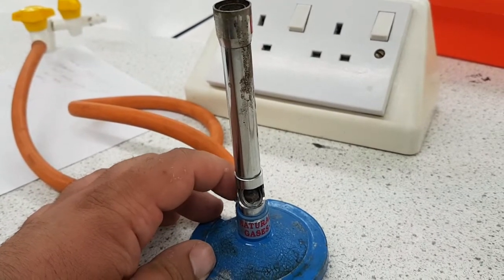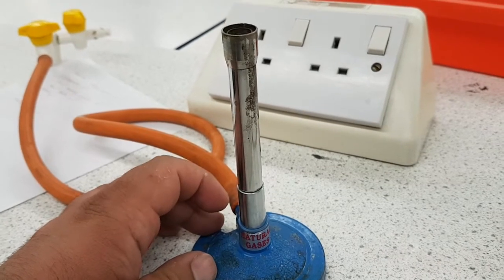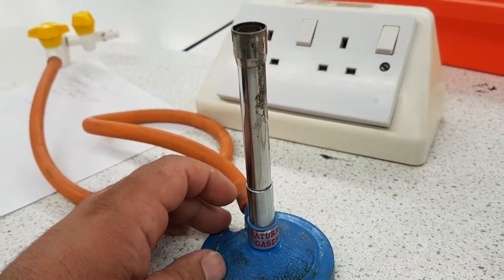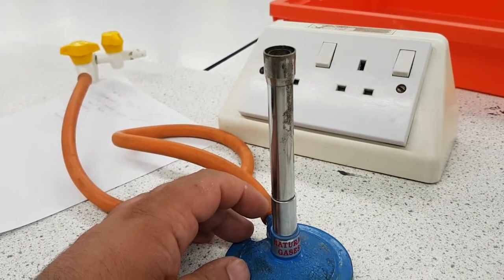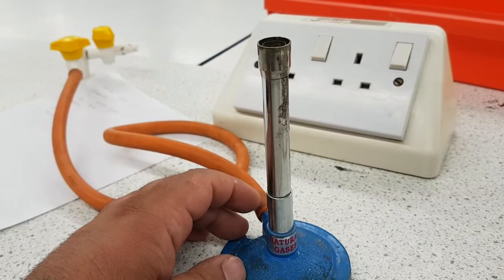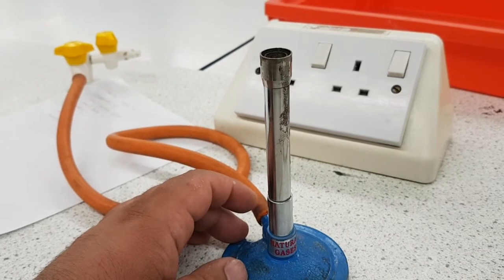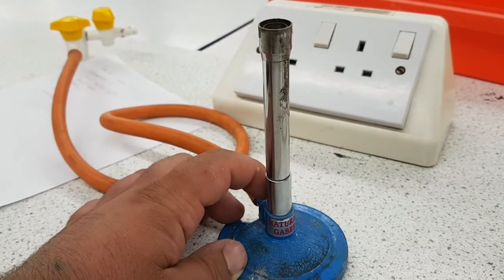When you want the flame to be visible, you close the hole, meaning you're not getting enough oxygen into your Bunsen burner, so the reaction is an incomplete combustion reaction. Therefore you see an orange flame, which is evidence of carbon being burnt. You do not heat with an orange flame — it's just so that the flame is visible for safety. When putting the Bunsen burner on for the first time, make sure the hole is closed.